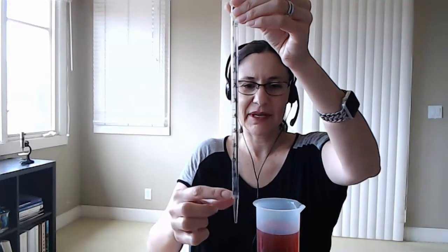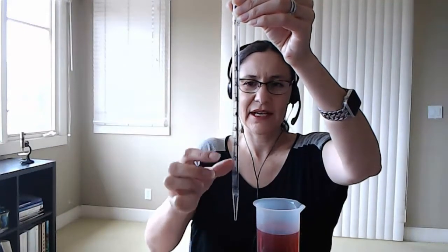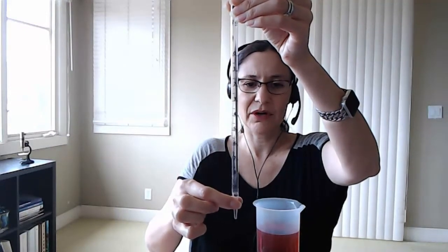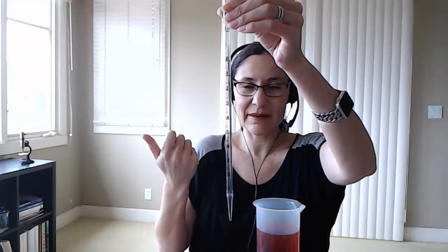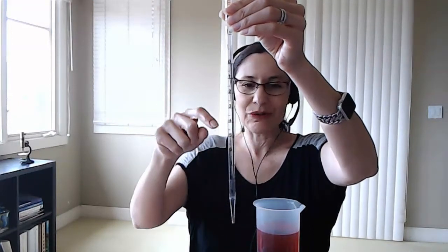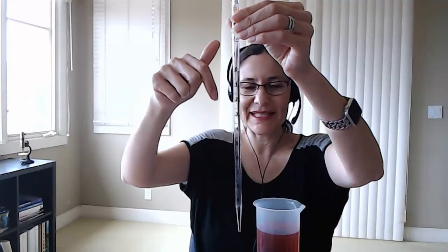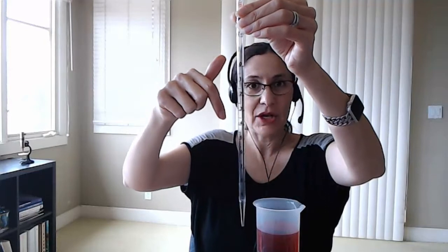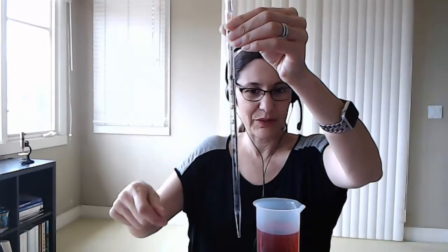It is 9 mLs, 8, 7, 6, 5, 4, 3, 2, all the way up to 0. Now this is a little bit opposite of what many students think about when they're drawing volumes. Normally you think about 1, 2, 3, 4, 5, right? Well, in science, we kind of do it opposite. We measure the volume as we are releasing the solution into whatever it is that we're using.